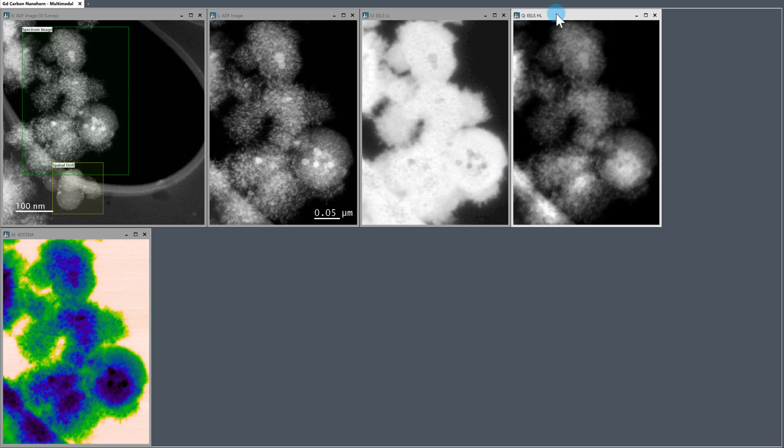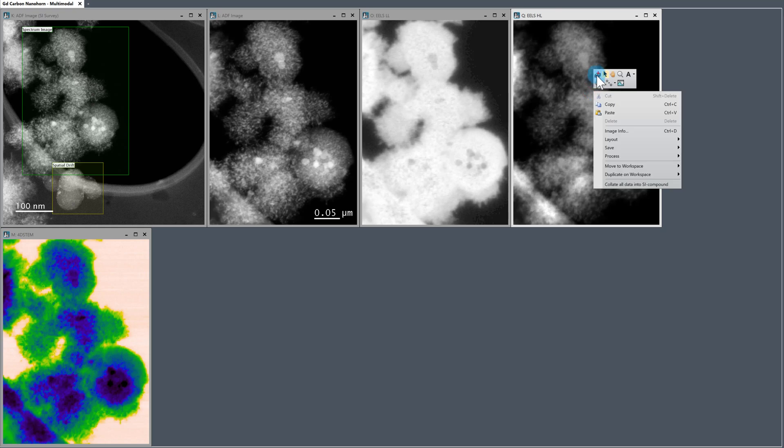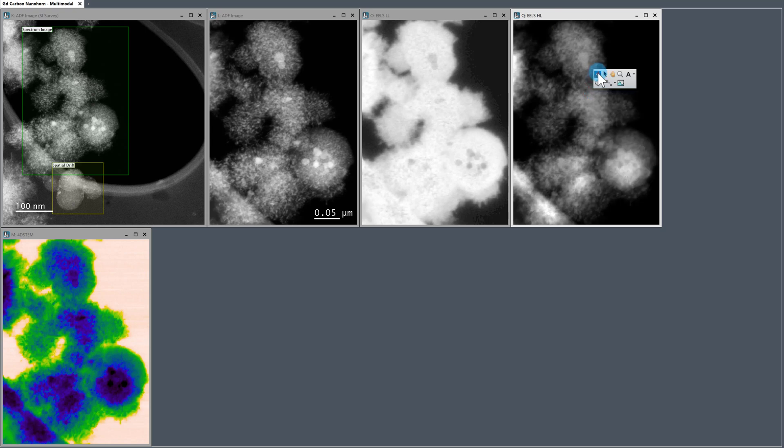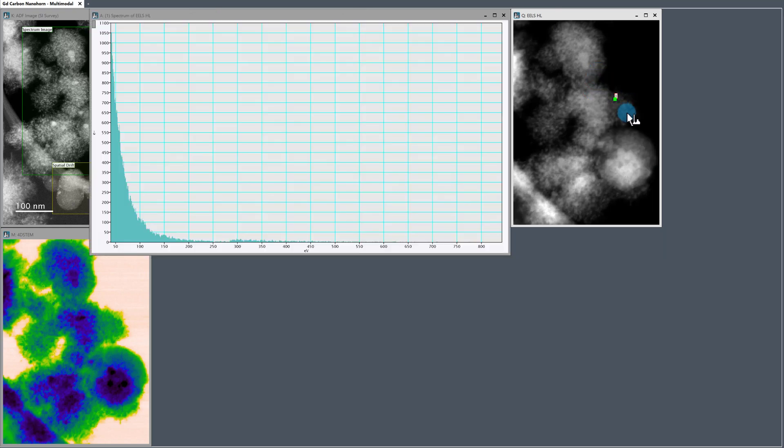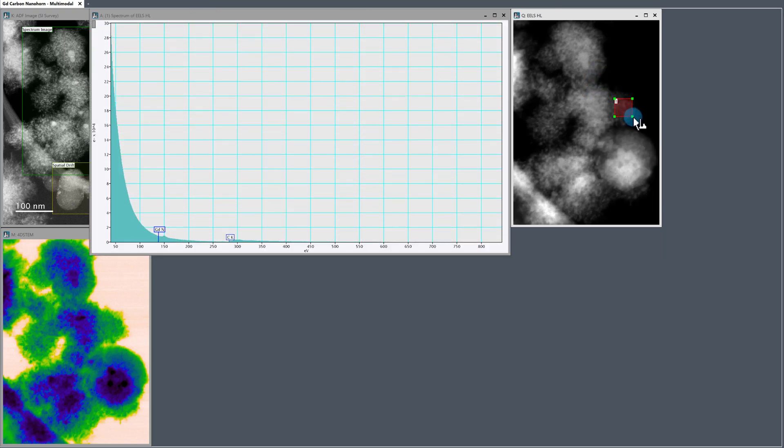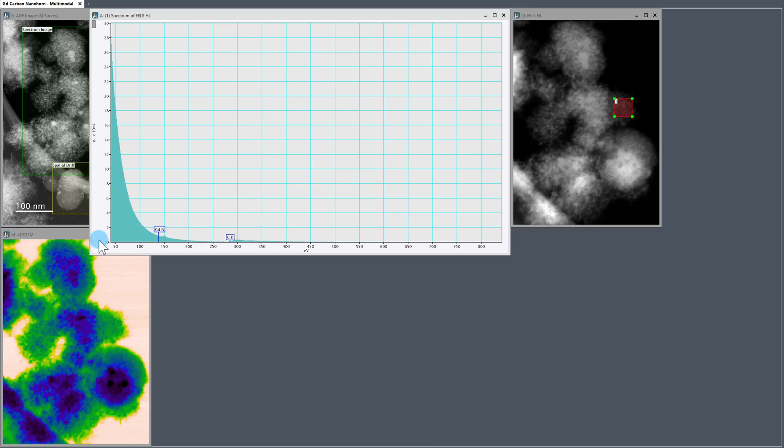I'm going to start off with the EELS high-loss and do some mapping. So right-click, use a spectrum picker tool, and let's sum the energy loss spectra from this region here.